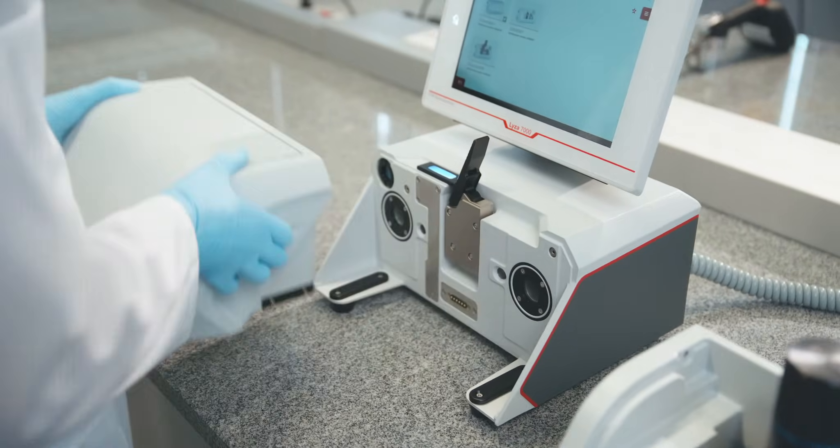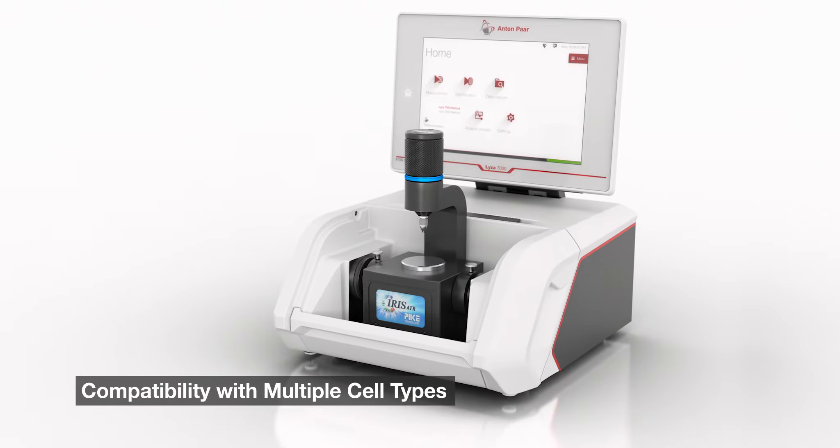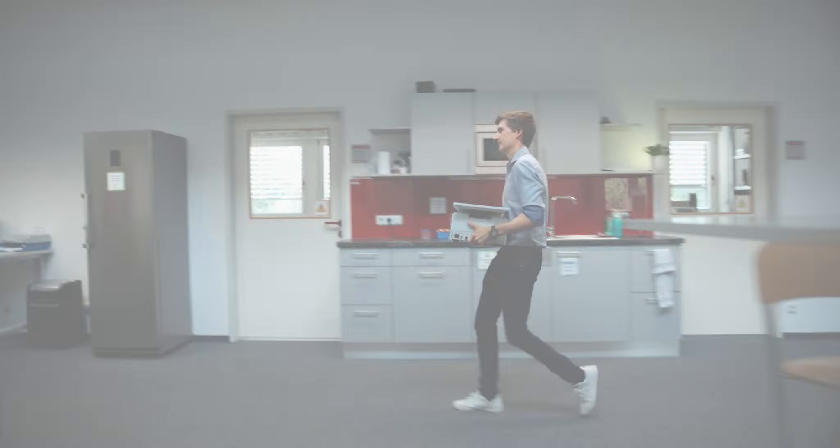It's flexible. The modular cell concept lets you measure a huge number of sample types — solid, liquid, or gaseous.